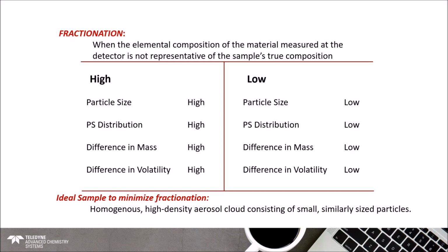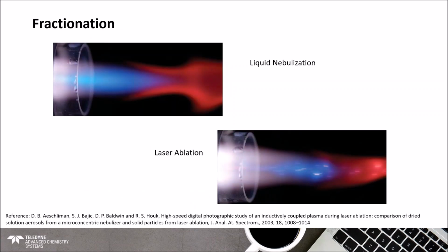Okay. And kind of giving you a visual of this, I want to talk about the difference in the way that the sample looks when it reaches the torch. Most of us are familiar with or spent the majority of our career doing liquid nebulization, where you end up with this very consistent, flat, high sensitivity signal. Laser ablation is different because you're actually taking particles and putting them into the torch. So it tends to be less consistent.